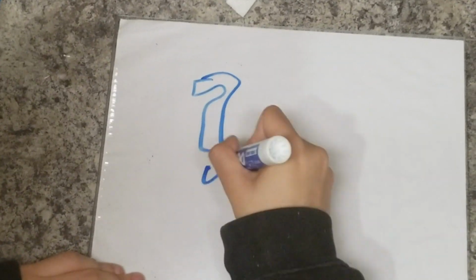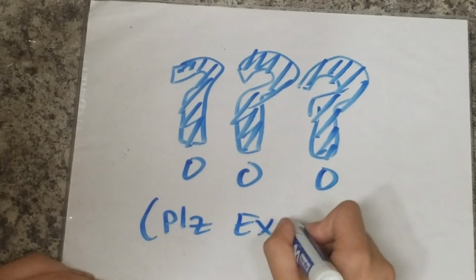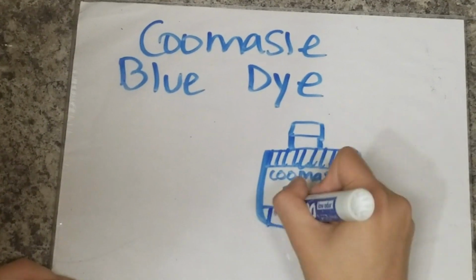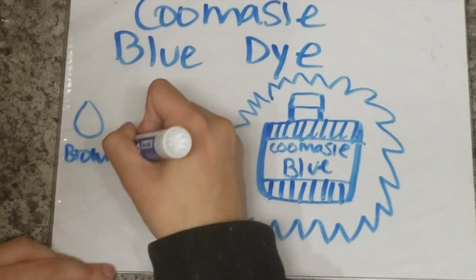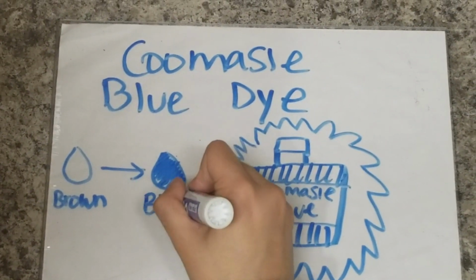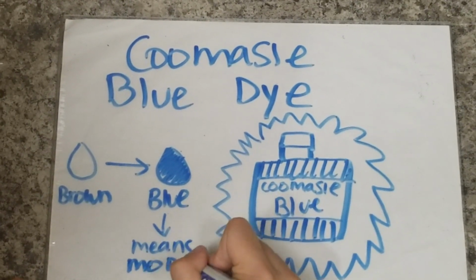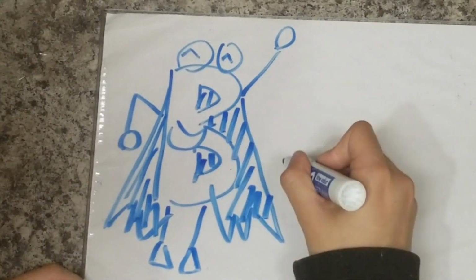But how do you do the Bradford Assay? First, a little understanding of an important reagent is needed. The Bradford Assay contains a chemical called Coomassie blue dye, and based on how much protein is present, it will change colors from a brown color to a blue color. This is because certain amino acids will react with the dye to absorb blue light. In other words, the more blue the sample is, the greater the concentration of protein that will be present. The Bradford Assay has saved the day.